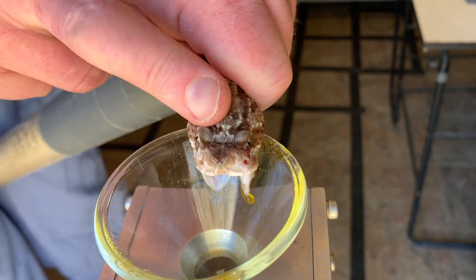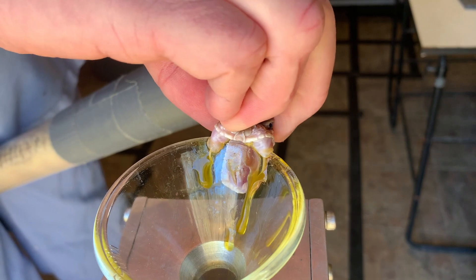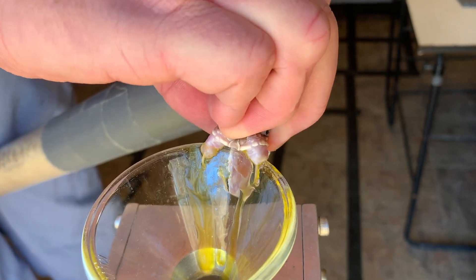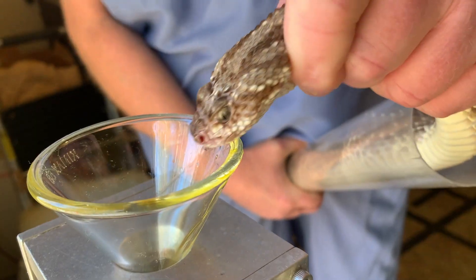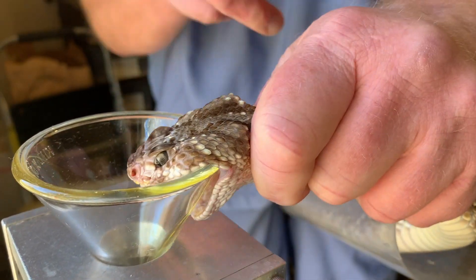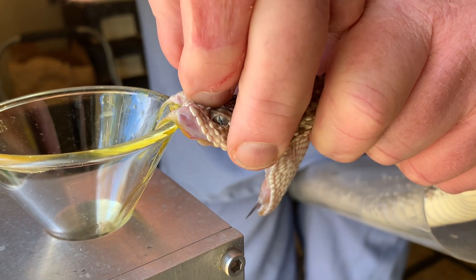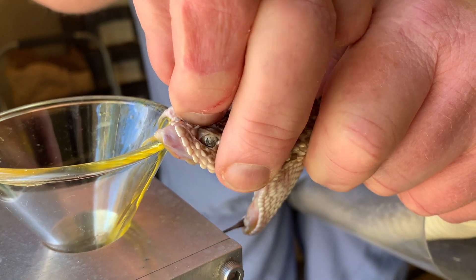Here are a few more shots to wrap up of the snakes actually biting the funnel, where you can see the venom coming out. This one is a little more yellow than the one earlier in the video. And here's one that's a little bit reluctant to actually bite, which does happen sometimes — but then it does give some.